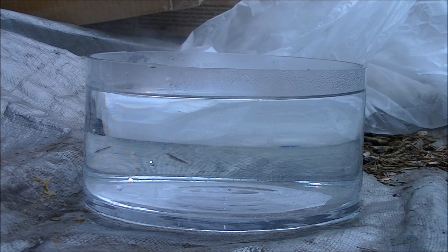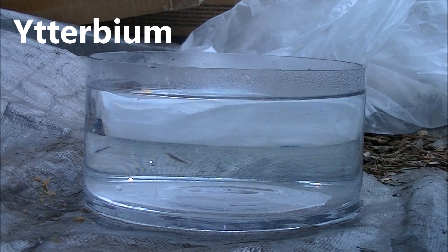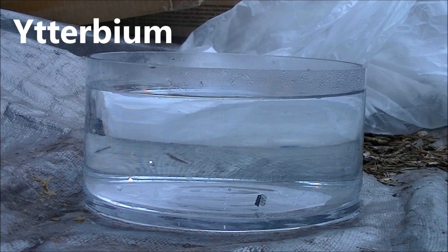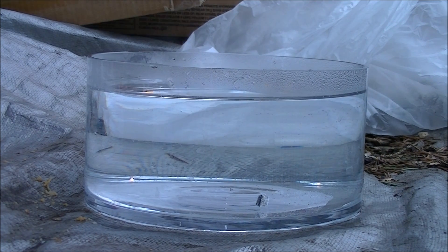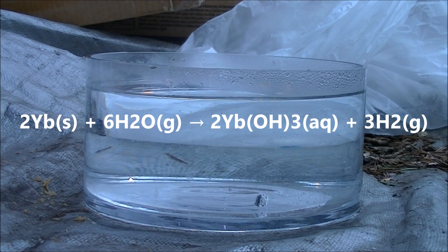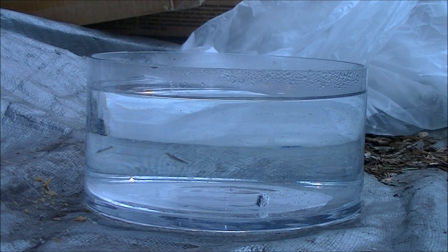Seeing as how the first series of the transition metals turned out to be really underwhelming, I decided to include a bonus — ytterbium, the lanthanide that's most similar to the scandium family. As was explained before, ytterbium is not a group 3 element, but it is very similar to them, and as you can see, it behaves very similarly in water with an extremely slow reaction.